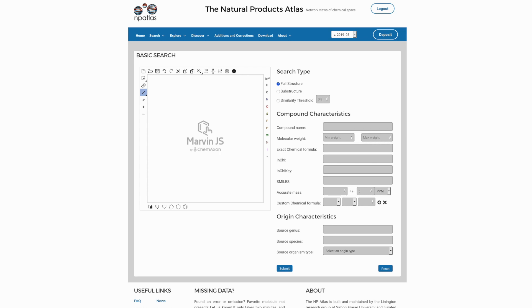In this tutorial, we're going to examine a variety of ways to use the Natural Products Atlas to de-replicate structures on the basis of spectral data. There are a range of ways you can do this. We're going to start here in the basic search page using the structure drawing tool.